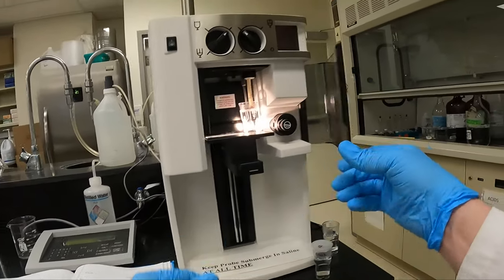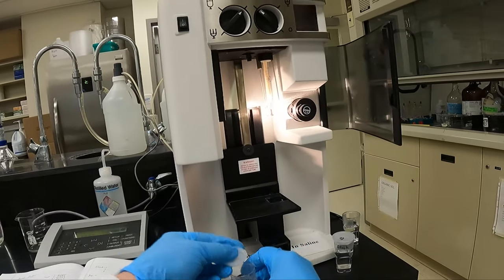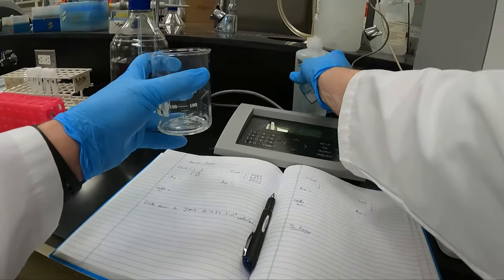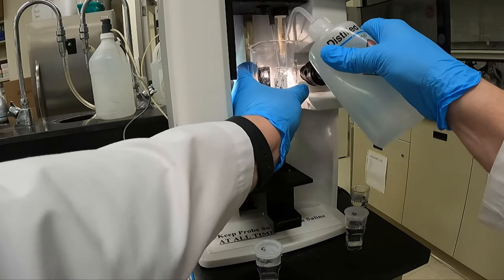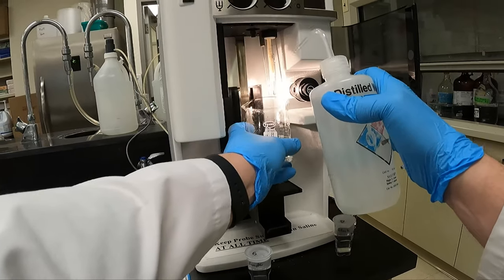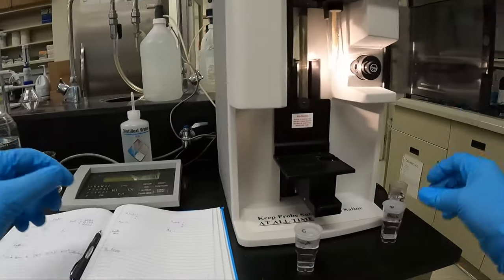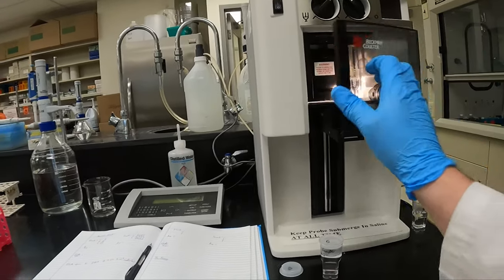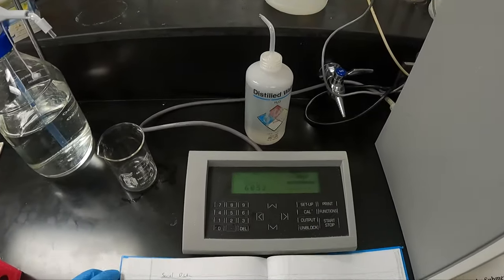Let's now remove the sample and wash the probe. We're going to run this again, so let's give the probe and the samples time between the runs. So again, when we're done, we'll rinse the probe with distilled water, the same way we started with. Cells on the outside should be gone, and then we'll rinse the inside by running the blank one time. The blank should contain no cells inside. In my lab, I like this number to be below 50. If you get above 50, run it again. If it's still above 50, change out for fresh solution.